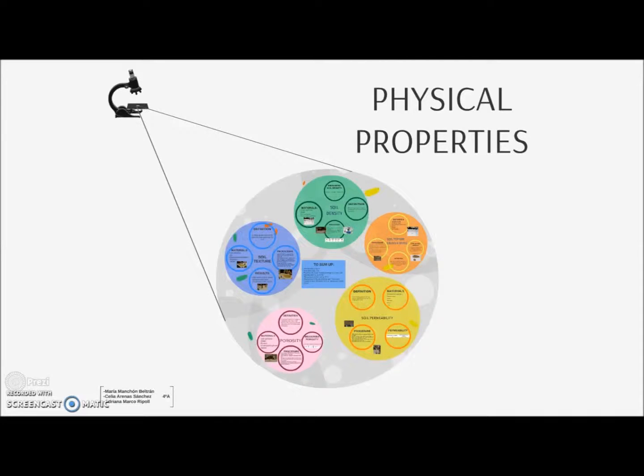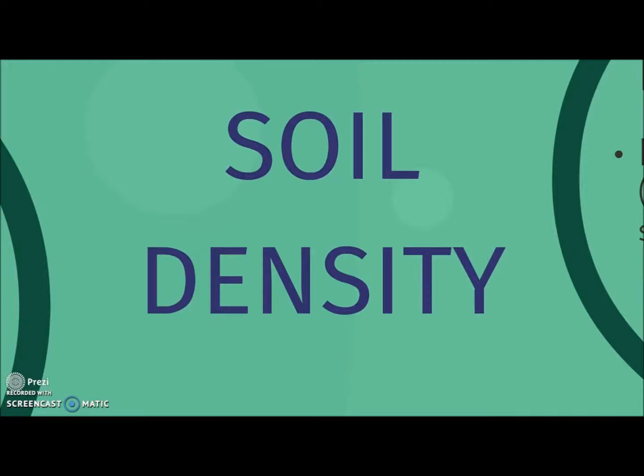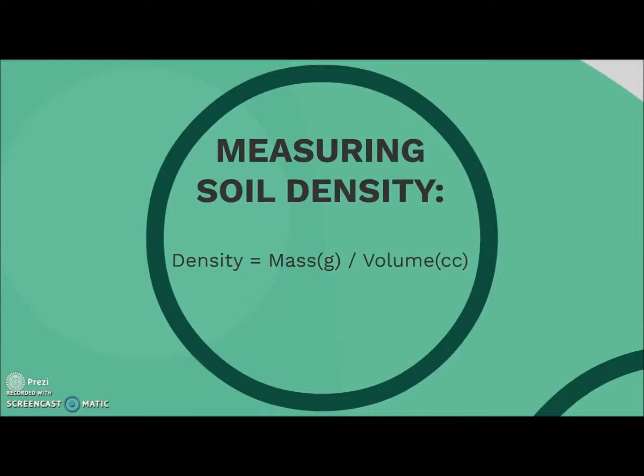Physical properties. Soil density. Density represents weight per unit volume of a substance. This is how you measure soil density.